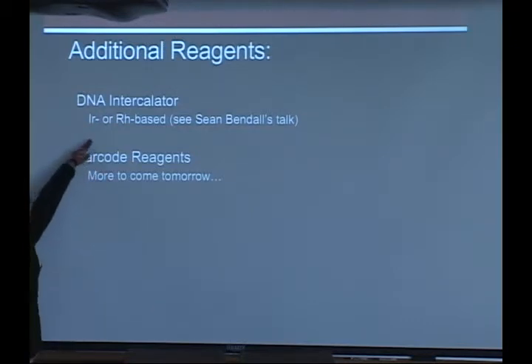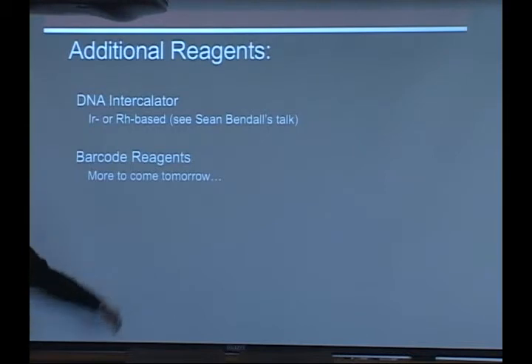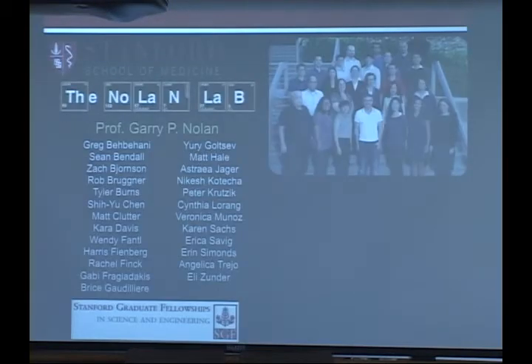And so that intercalator that we often use is iridium-based. And Sean probably talks a little bit about that. And then another thing that we use commonly are the barcoding reagents that Eli will talk about coming up. So hopefully that gives you an idea of how you might go about starting to develop the tools that you would want for your own CyTOF experiments.